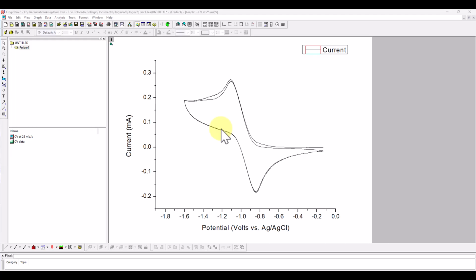And so we, in my lab, tend to produce voltammetry data under what's called the Texas convention. And in that case, reducing current, where electrons are flowing from the electrode into the solution, is positive current, so greater than 0, and oxidations are negative current. And so the data we have here is plotted correctly in that format. This is reducing current, this is oxidation current.